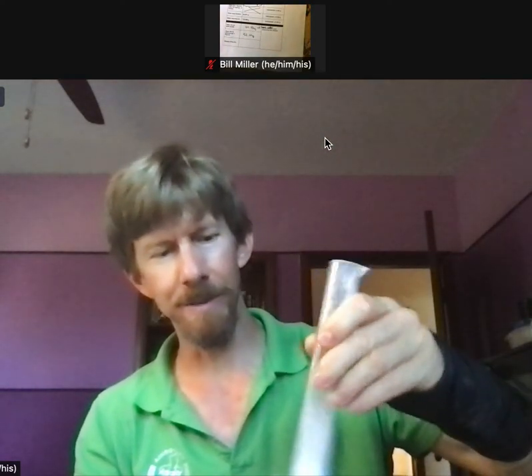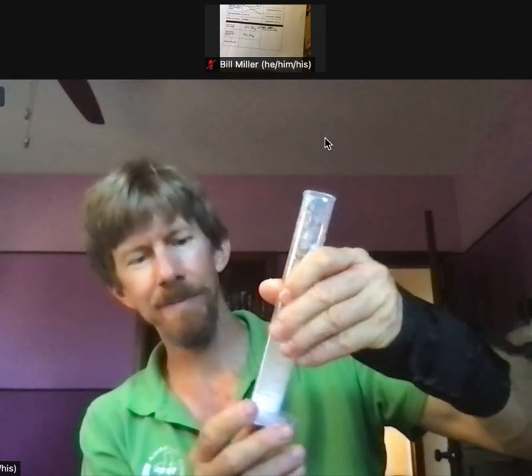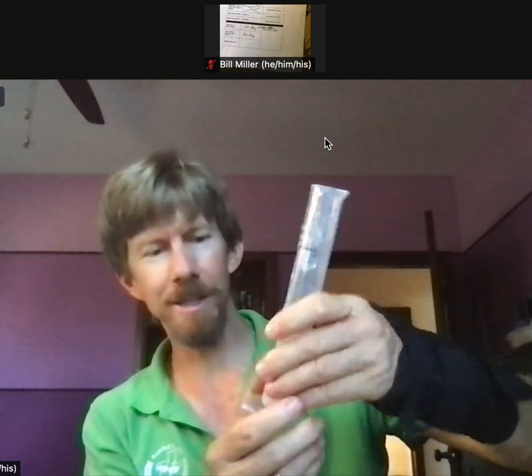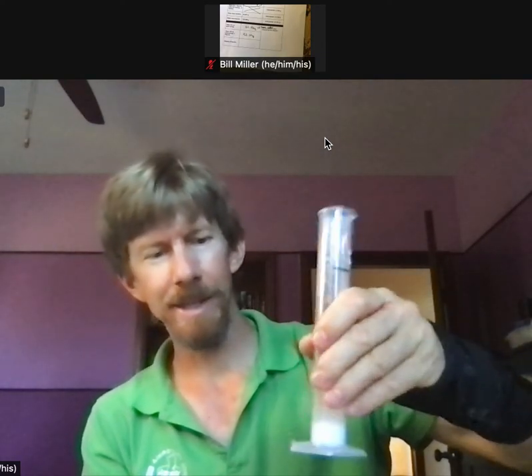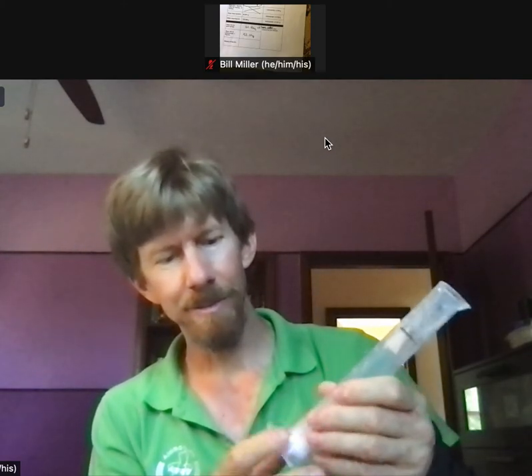Ooh. Feel it. It feels very warm. Something else is going on here. This is an exothermic reaction. It's giving off heat, and that heat, I don't know what's happening down there. Yeah, it's getting very hot. Good, good. That means that experiment six will work.